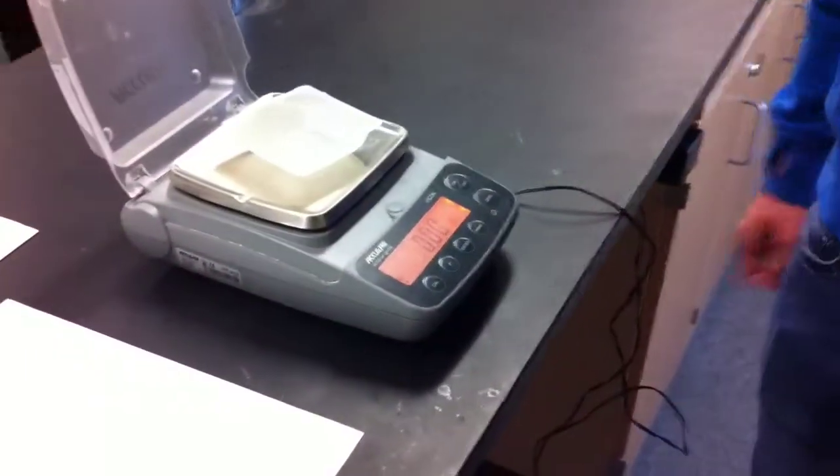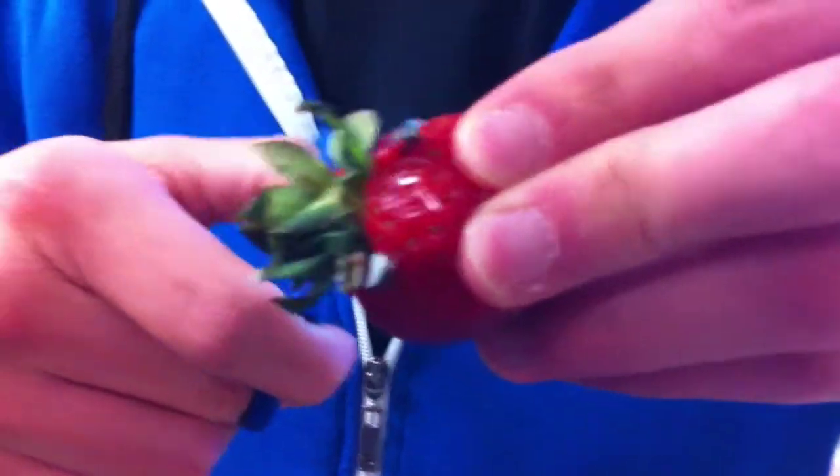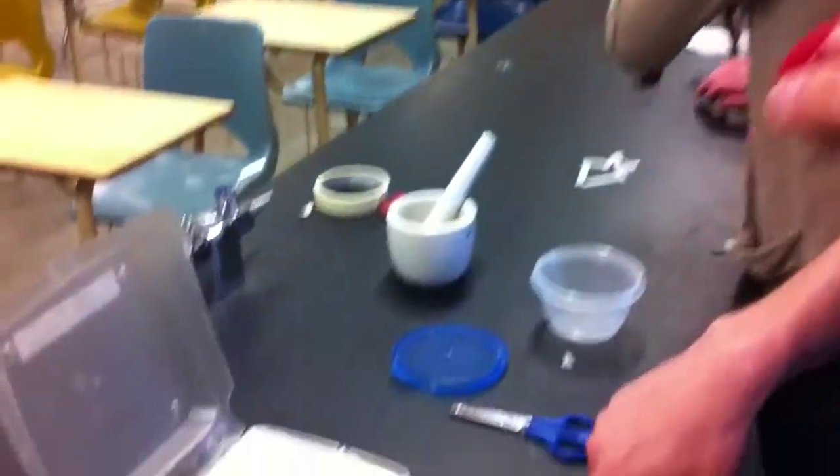Alright, so right now we're going to zero the scale. We're going to put it in the already zeroed box.